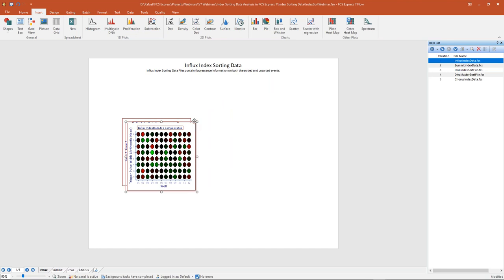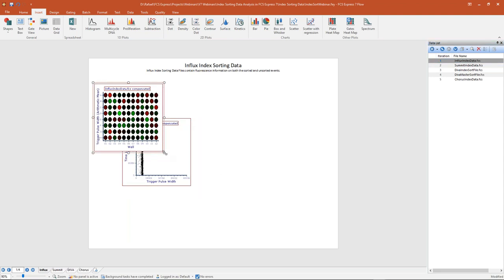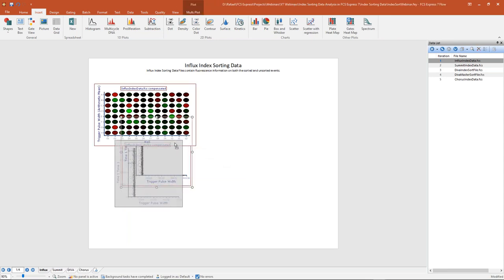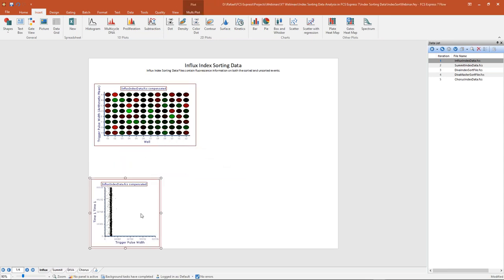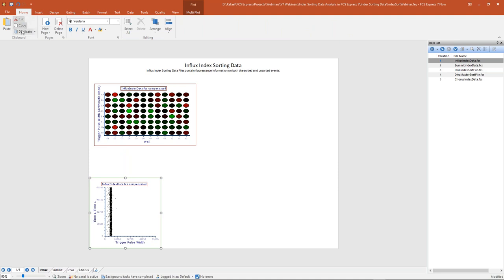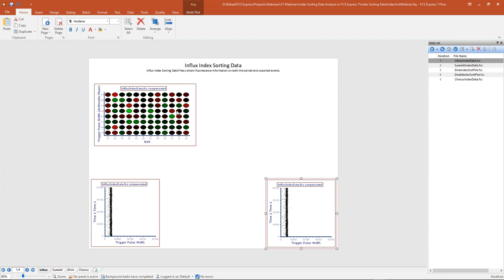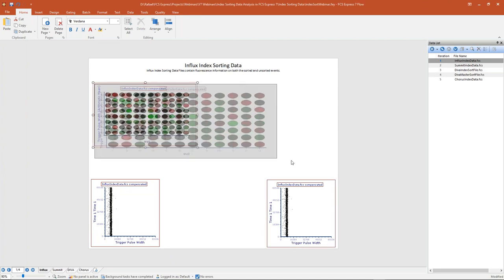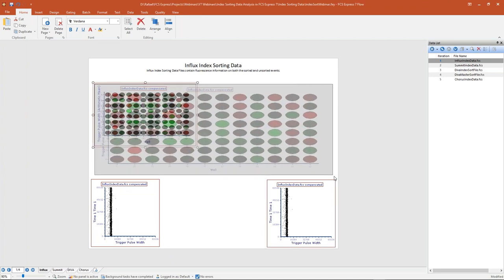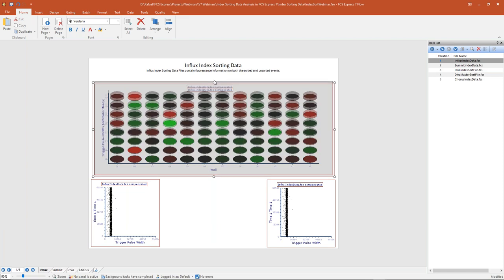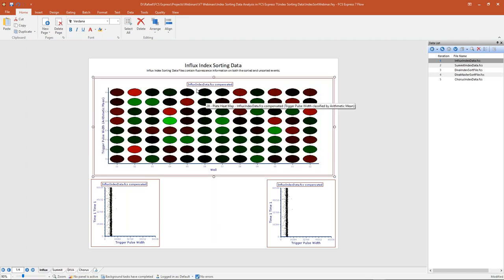The plate heat map is just the same as any other plot type in FCS Express, so I can move it around and resize it. I'm going to duplicate this color dot plot, move it to the right, and resize my heat map so that we can see all 96 wells, which represents 96 sorted events from my Influx. Now that my plots are arranged, let's go ahead and set up my plate heat map.